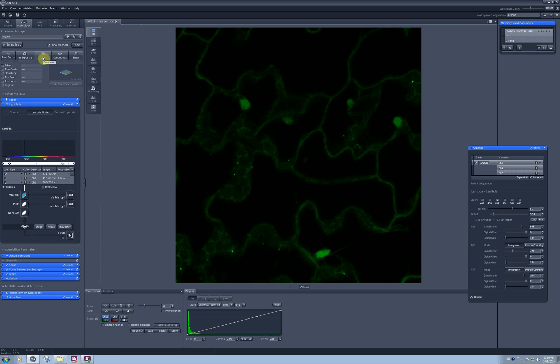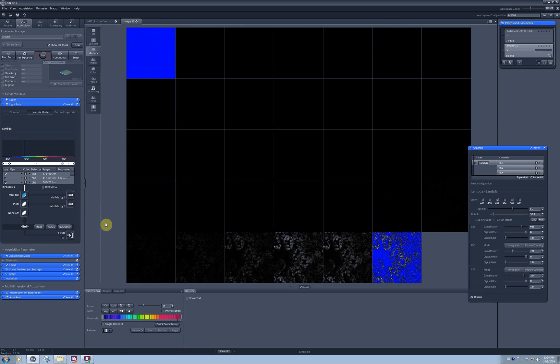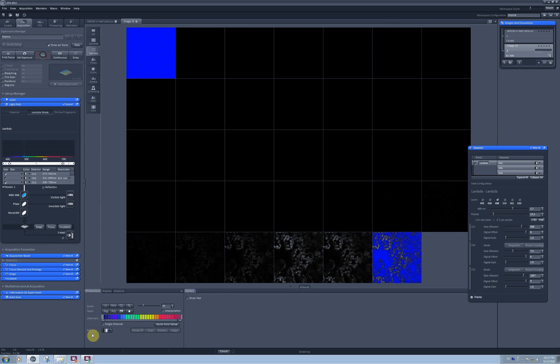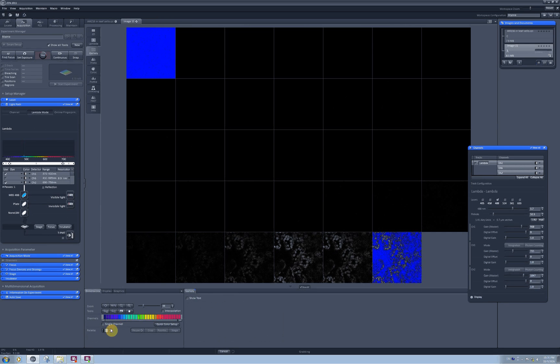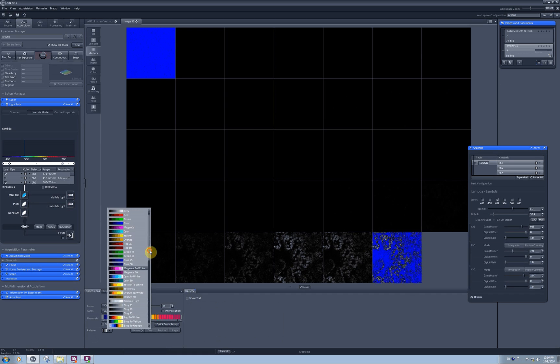For this you can go to live scan. And in the palette you can select range indicator option.